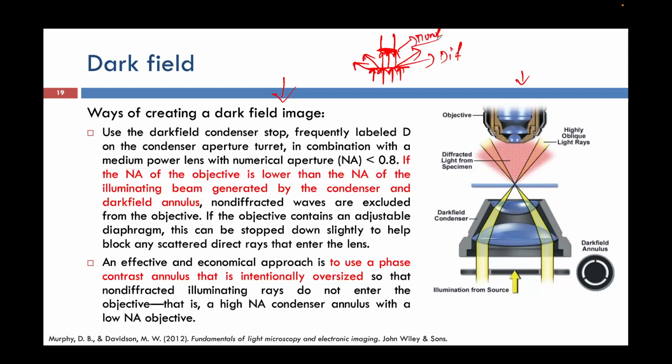So these are the diffracted rays, and these are the non-diffracted rays, and this is the lens. In this combination we are able to visualize currently that this is non-deviated, this is diffracted. Then how to put this lens in such a way that, now I have told that a dark field image will consist of the diffracted ray? If I am considering this as my lens, shall I change the position of my lens from vertical, like this? This is the question.